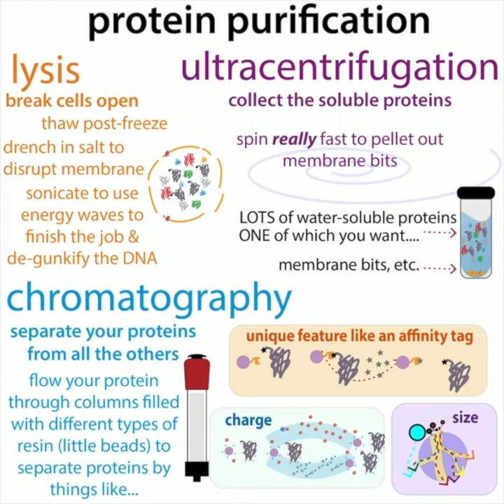You can test and see, does it cut DNA? If it does, there's good chances that your protein is made properly. If you don't have a functional assay, you can do size exclusion chromatography, and you should see a nice sharp peak representing a well-folded protein at least.